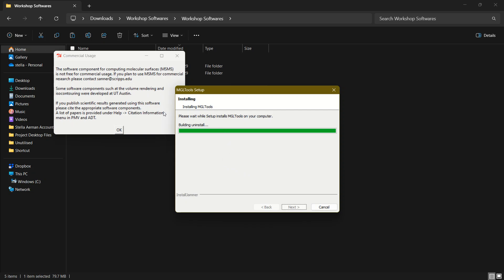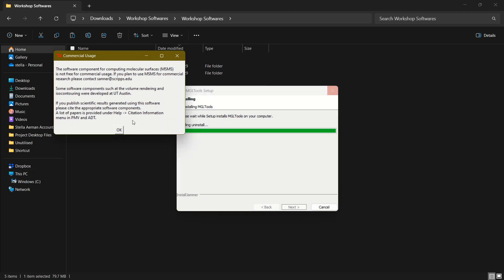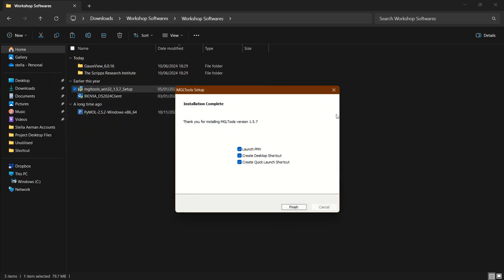Once the installation is complete, a pop-up will come up — this is very important. When it comes up, simply click the OK button; that will be the end of the installation. It will tell you 'thank you for installing this.' You can either launch it immediately or create a desktop shortcut or quick launch shortcut. Since we don't want to launch it yet, we can just uncheck 'Launch PMV' and that is all.